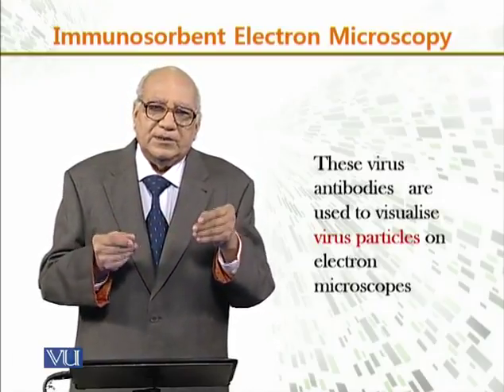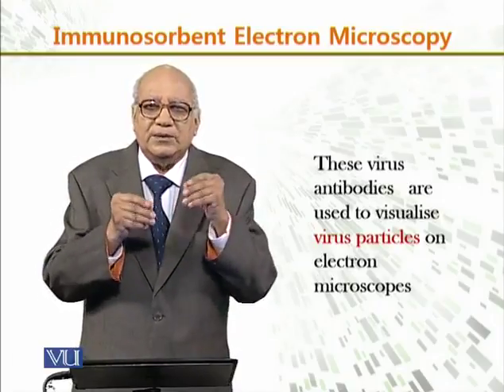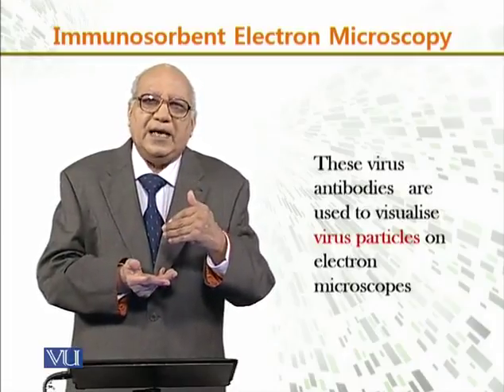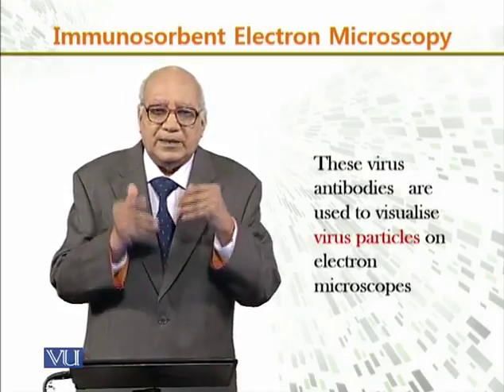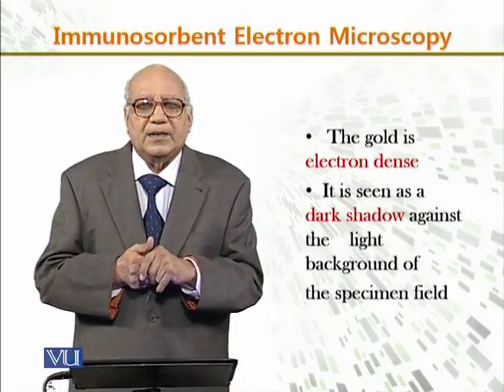You see, once we conjugate the antibodies on the gold particle, then we can visualize. Actually, we can see on an electron microscope the virus particles which are there.